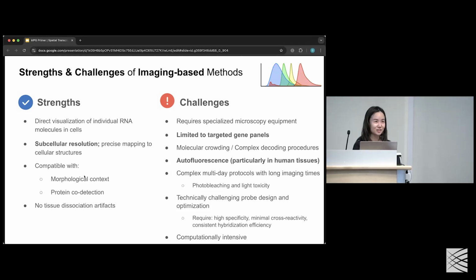You can. One of the technologies that I use is, well, 10x has this Flex kit that has probe-based capture, but it captures the whole transcriptome. And depending, you can just change out the handle so that it's binding to whatever transcript of interest.